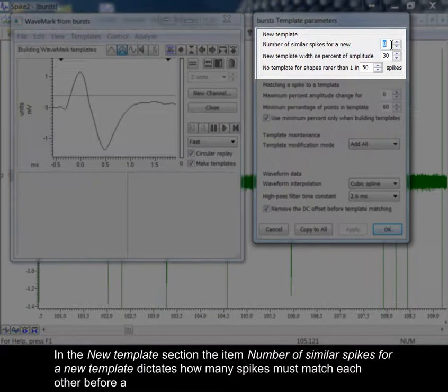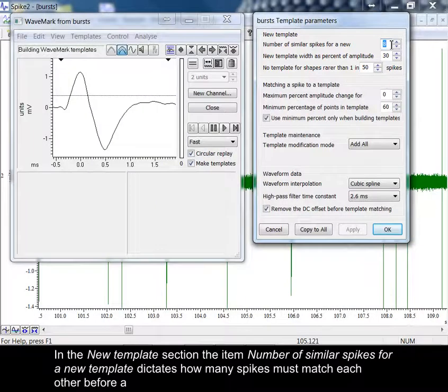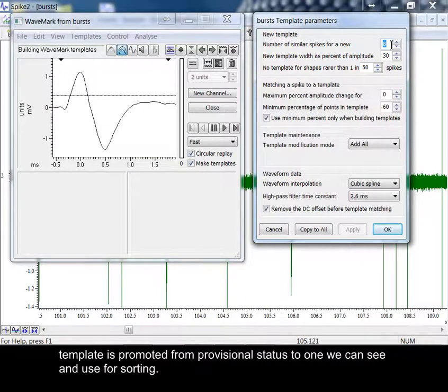In the New Template section, the item number of similar spikes for a new template dictates how many spikes must match each other before a template is promoted from provisional status to one we can see and use for sorting.